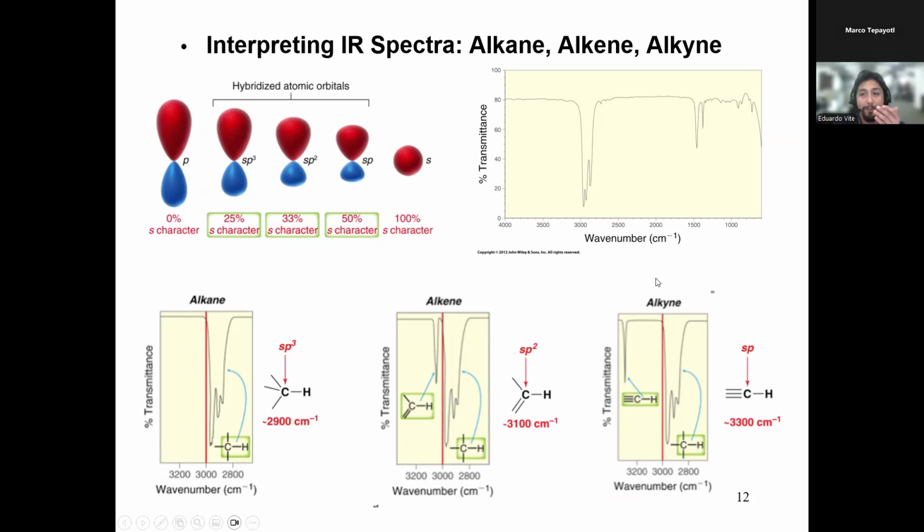Alrighty. So yeah, just because you have no functional groups doesn't mean that you can't get any info. And actually, this is what a standard alkene, alkyne, alkane IR spectrum looks like. You're often going to see this peak right here from 3,000 to about 2,700. It kind of looks like a hand, like a stalactite from a cave. And usually you will see the rest of the spectrum is kind of just not really that interesting. Like there's nothing after 3,000. There's nothing between 2,700 and 1,500.